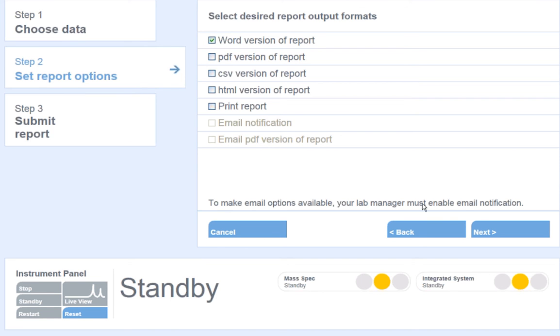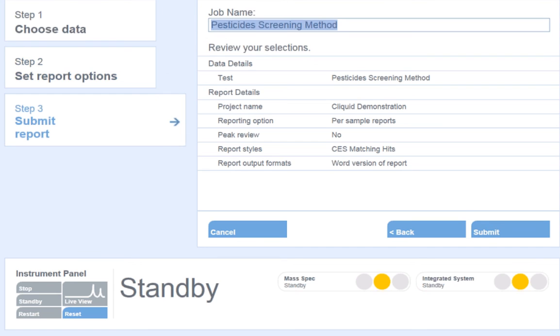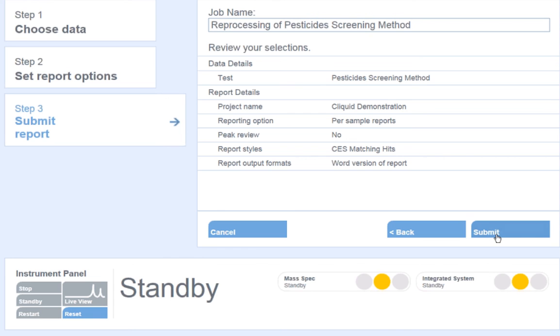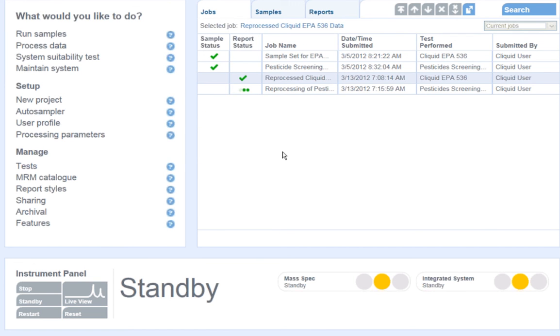Select the format for the report output. This can be Word, PDF, or email notification. Lastly, I will input a name for this job. Here, I will call this job Reprocessing of Pesticide Screening Method and hit Submit.